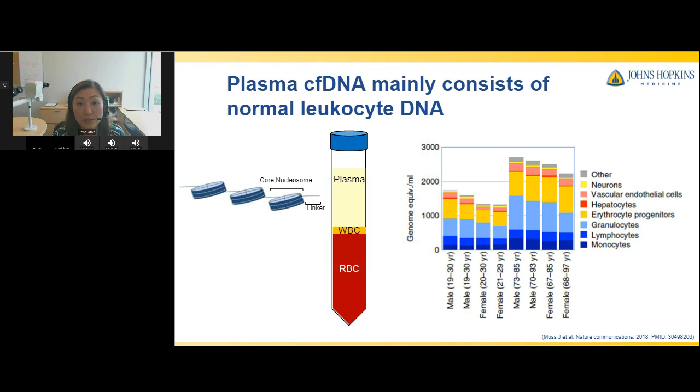Sometimes there is linker associated with it, but we call these cell-free DNA molecules either mononucleosomal, i.e. one single unit, or dinucleosomal. Occasionally you will see a doubling of the length. The mononucleosomal molecules are typically around 150 or 160 bases, which is far below the amplification requirements for even framework 2, not to mention framework 1 amplicons.